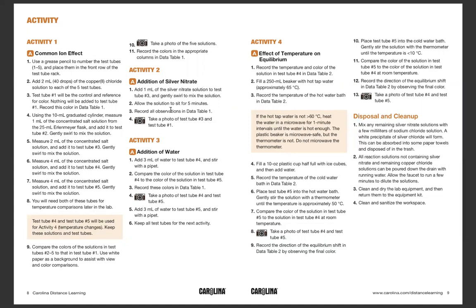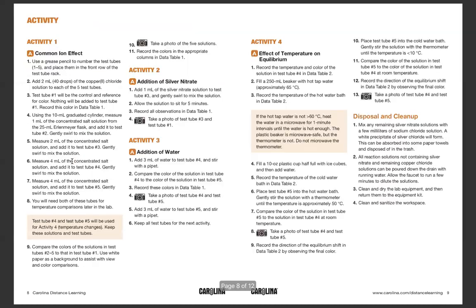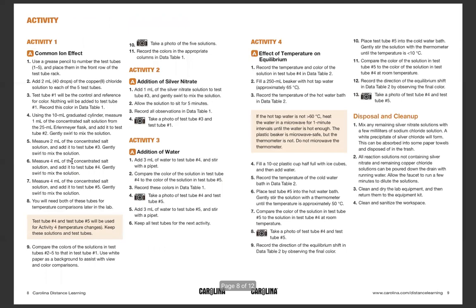step mentioned in the lab procedure, so that you should attach them for table 1 and table 2. Table 2 is the effect of temperature. Table 1 is for change in concentration. And you will be using, just the way I showed you, the thermodynamic or thermochemical equation.